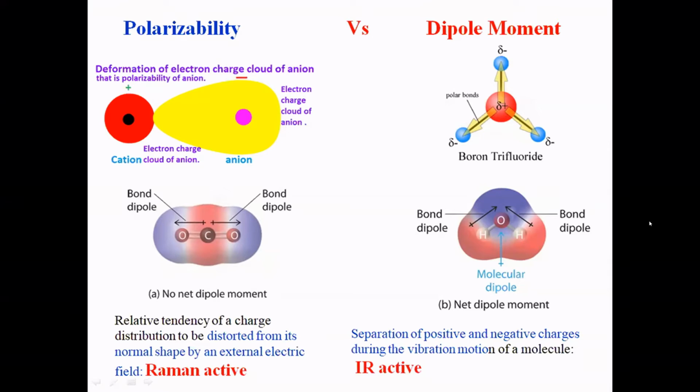But the dipole moment is a similar phenomenon, where the separation of the electrons in the bond can be easily split into two different heads, so that they are partially plus and minus. That will be permanent, a relatively stable charge species sitting on each head. So this is a dipole. They act as a perfect dipole because you can exactly denote plus and minus within the two atoms. Those kinds of dipoles are highly sensitive and capable of absorbing IR radiation. So if you do IR for dipole compounds, it will be easy to get the structures.